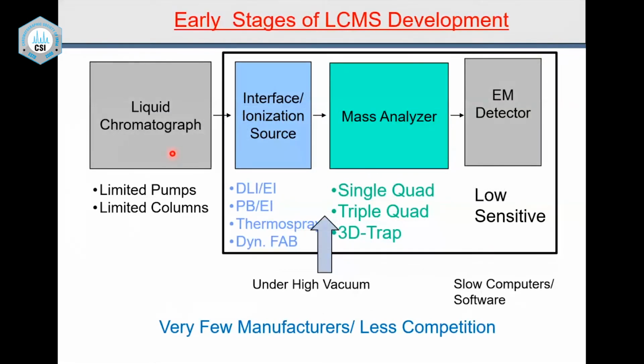So this is the liquid chromatograph. Now, what was the challenge? Making a GCMS was so easy. What was the problem with the LCMS? When you have a 1 milliliter flow rate and you put it into the ion source in a vacuum system, 1 milliliter can become 27 liters or 30 liters or more, depending upon the solvent. That is something the pump cannot take up, and the mass spectrometer will fail.